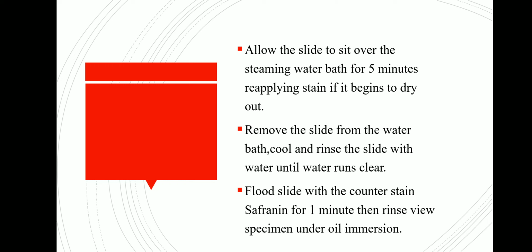Next, remove the slide from the water bath, cool it, and rinse the slide with water until the water runs clear. Next, flood the slide with the counterstain, which is safranin, for 1 minute, and then rinse it and view the specimen under an oil immersion microscope.